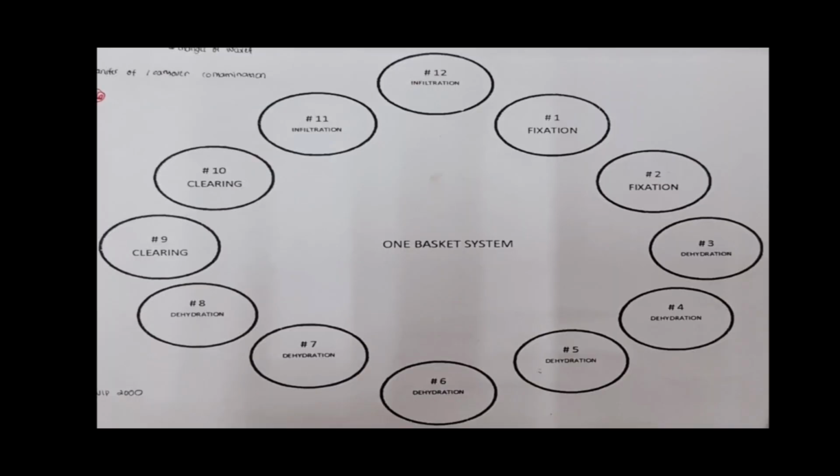So let's have one example about this. Let's say the time started for tissue processing is at 4 p.m. This means in fixation basket number 1, you have to allot 4 to 5 p.m. And then for fixation basket number 2, since this is another hour, that's 5 to 6 p.m. So just for fixation, you have allotted 2 hours, that's 4 to 6 p.m. for 2 baskets. This is shortened because of agitation. So with the help of agitation, class, the fixation process is shortened.